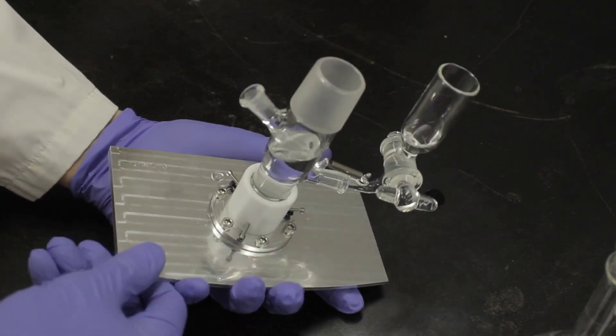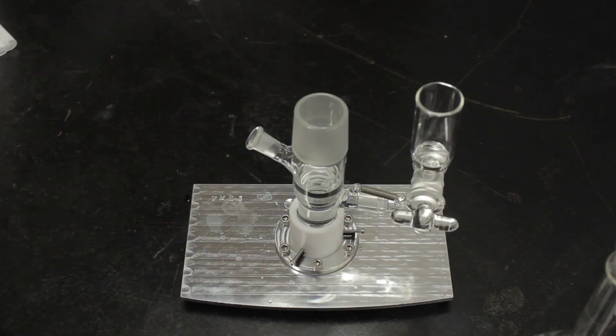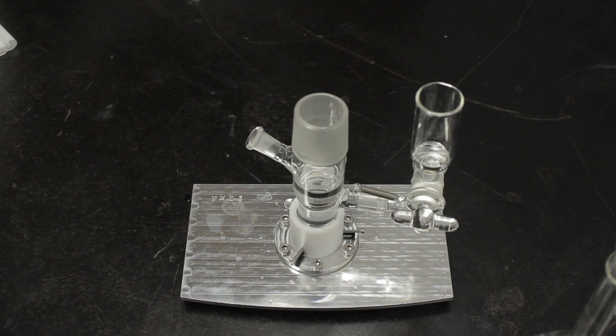Note that the stopcock is kept closed at all times when using the J1 cell. The wetted ground glass surfaces of the stopcock provide a conduction path while mitigating chloride ingress into the main cell body.